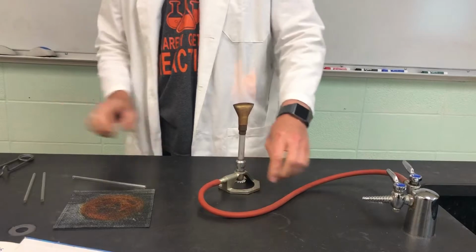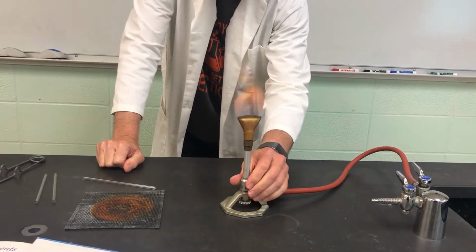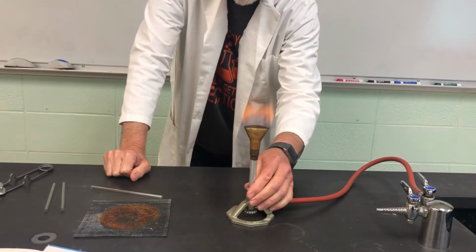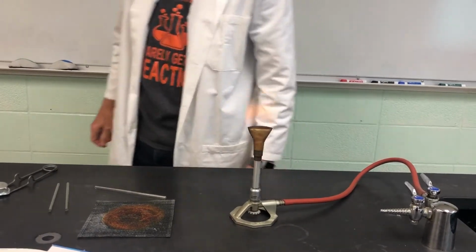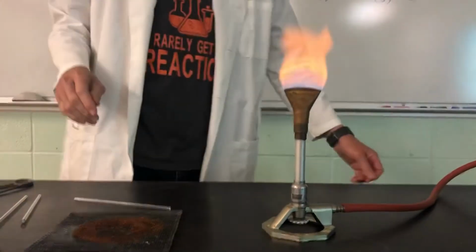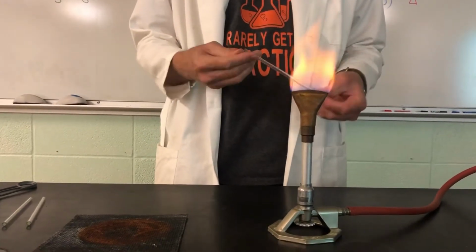Okay, I've shown y'all how to do these bending of glass before, students, but some of you that are watching for the first time may not have seen that. It looks like we have a little extra different additives in our fuel at the present time. Sometimes it shows up a little differently. I'll turn off the light so you can see it a little bit better. They add an additive to the methane, so methane in its purest form you can't smell.